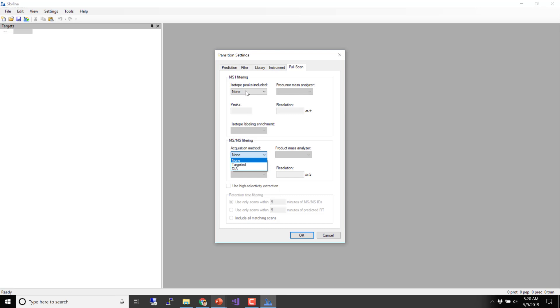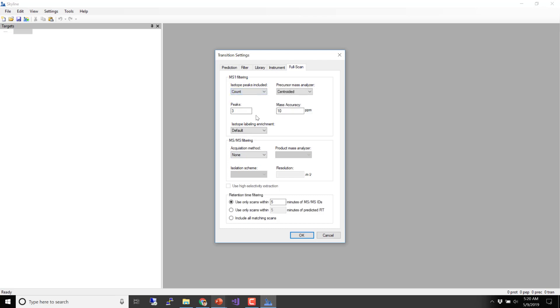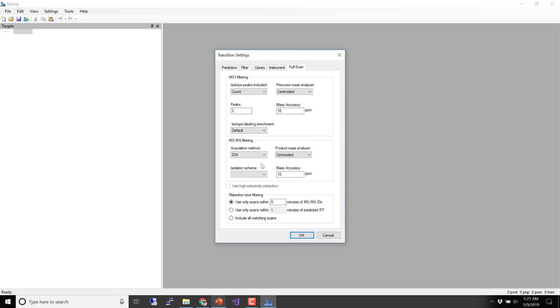We're going to do DIA today, and we can also do MS1. We'll use centroided data with a mass accuracy of 10 ppm, which works pretty well on most Orbitrap Q-Exactive data and even modern TOFs. All the way out to 20 ppm. We're going to do DIA for our MS/MS filtering — centroid with 10 ppm is a fine place to start. Then we need to tell Skyline about an isolation scheme.